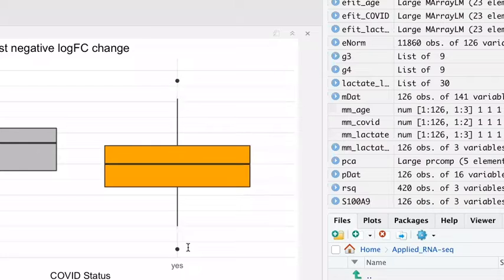But if you're actually subsetting within the normalized data set, that means you're removing a lot of data within your normalized data, and that data set is then not scaled or centered to what the original normalized data was, because normalization takes into account every single gene within every single sample and then gives you that numeric value to be added or subtracted.